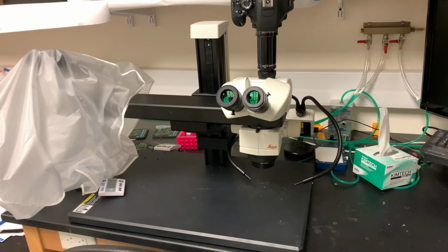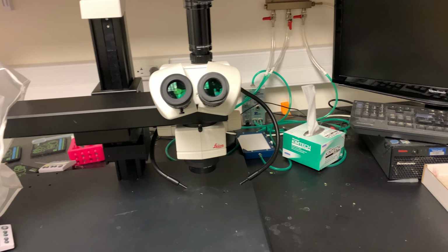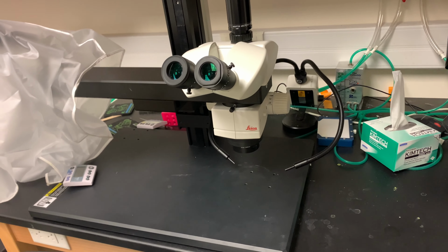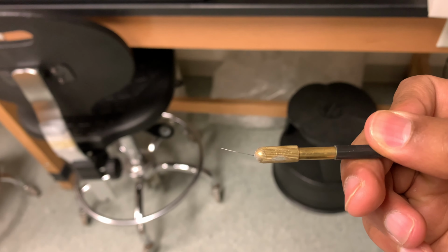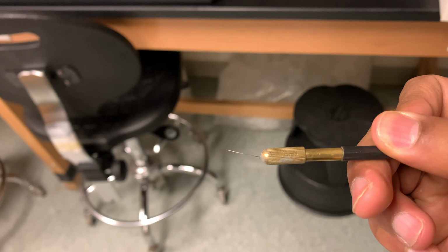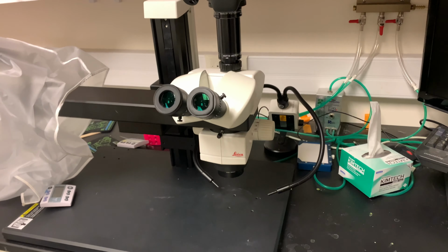So we're gonna be back on the microscope again to do our fine dissection, which is going to be tweaking up our products that we dissected on Monday. So we're gonna be using this very fine needle to do our fine dissection, and this really allows us to get rid of any unnecessary material that we have on our final products.